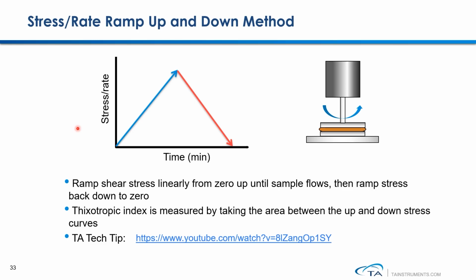On the TA Instruments website, there is a short YouTube video that teaches people how to set up this thixotropic loop experiment and how to analyze thixotropic index using TRIOS software.